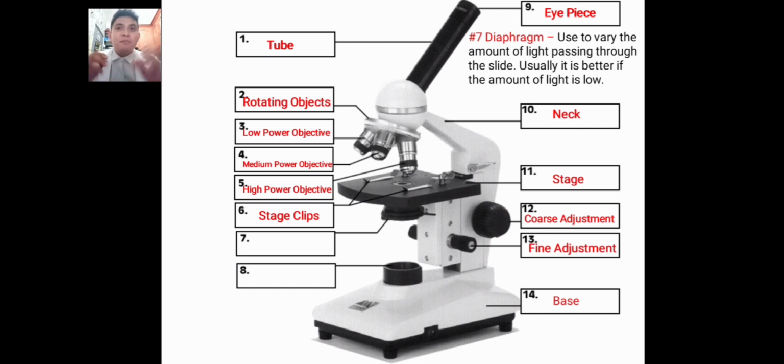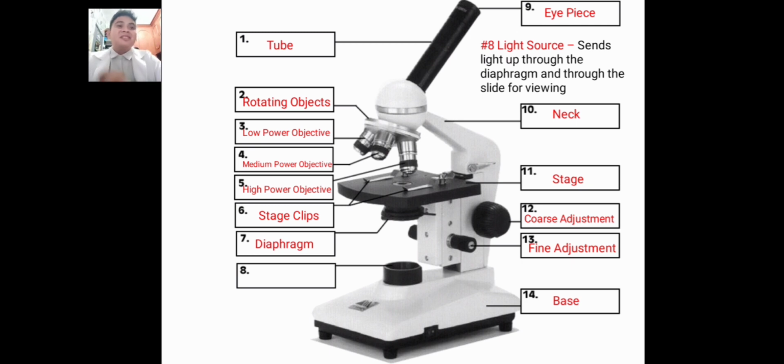that reaches the specimen. Yan. It's an adjustable apparatus. Hence, controlling the light intensity and the size of the beam of light that gets to the specimen. For high-quality microscopes, the diaphragm comes attached with an Abbe condenser, and combined they are able to control the light focus and light intensity that reaches the specimen. That is the diaphragm. And next is the light source.